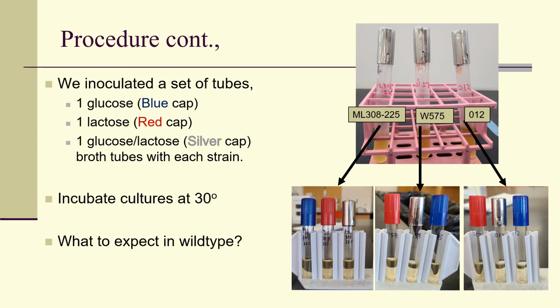These will be incubated at 30 degrees for 48 hours. And on the second session, we will look at the beta-galactosidase expression. Think about how the lac operon will be expressed in these 3 different kinds of media for the wild type strain.